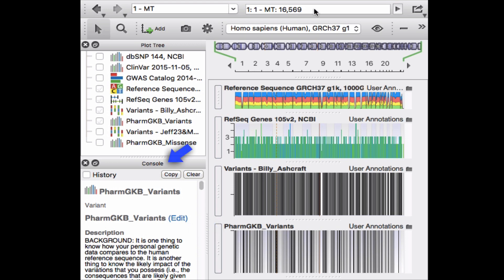Make sure the console window is visible. The console window can be made visible from the Genome Browse menu: View, Dock Window, Console.